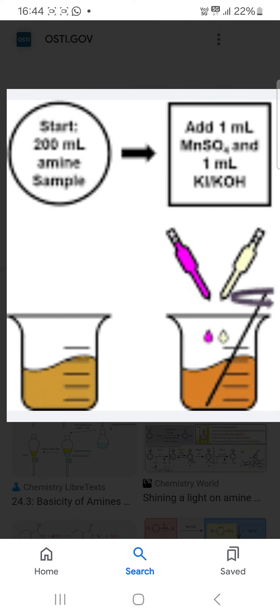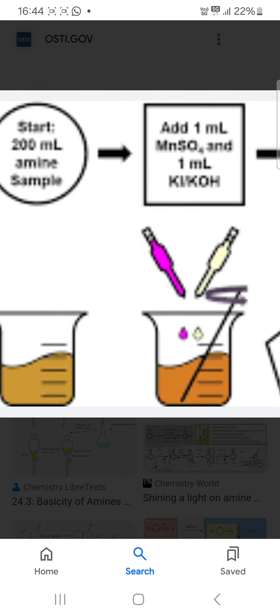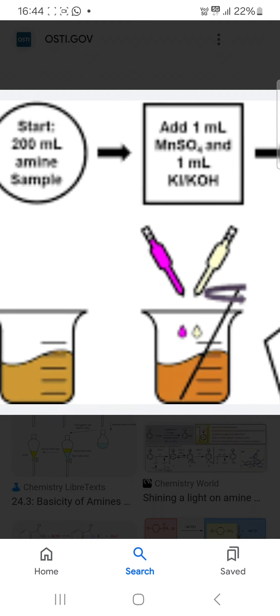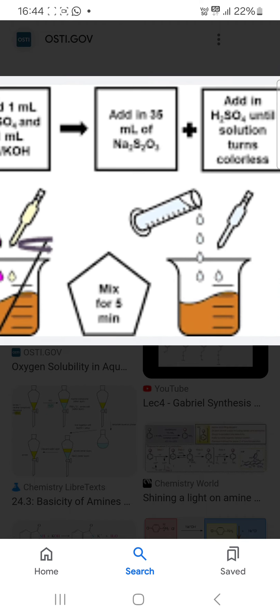Start with 200 ml. Then what you need to do: you have to add 1 ml manganese sulfate and 1 ml KOH.